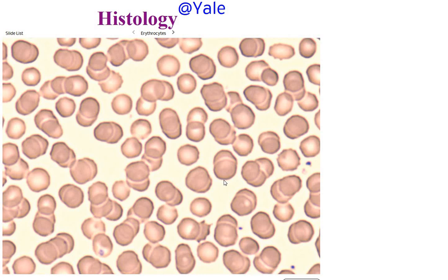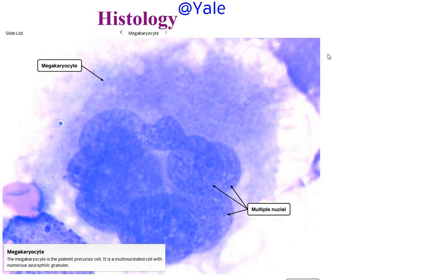And then the other thing we can see on a typical blood smear is going to be these little specks. These are platelets. And so we've talked a little bit about these before, but basically platelets come from a progenitor cell called a megakaryocyte. This is basically just a really big, mega-sized cell, and so this is what they look like from a greater than 40x magnification, so maybe 100x magnification, which is beyond the scope of our microscopes. But just to give you an idea of where platelets come from, they're going to originate from this precursor cell.